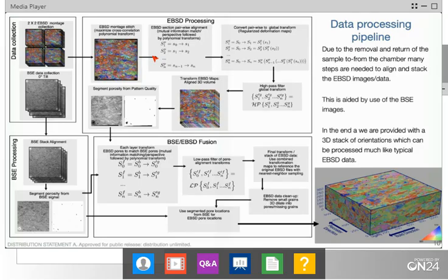One of the things that we found out, though, is that because of the directional nature of the additive manufactured microstructure, you can get a large grain that moves through your serial sections and can drag certain corners along with it. And so that required some further filtering of these displacement fields. What we did is we said, okay, eliminate any low frequency noise. We only want the high frequency displacements moving from section to section. That gave us a very good alignment of that data.